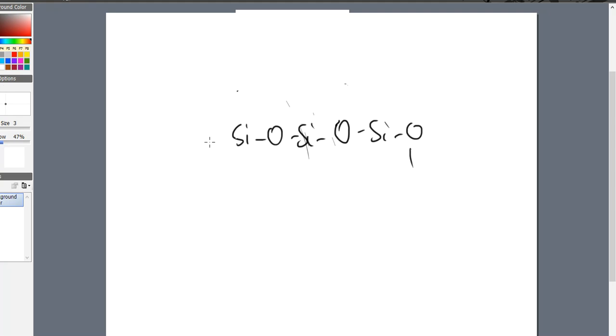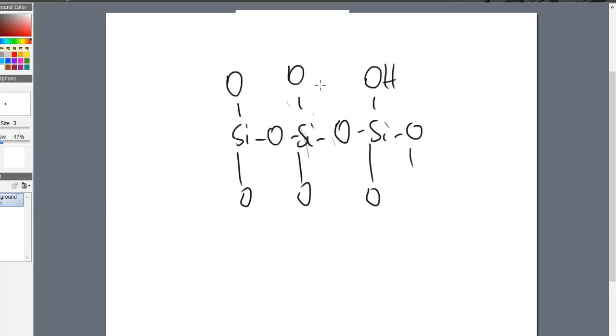Oh, no. Okay. So silica and silica and silica. I've got these other oxygens that are there, of course, and then on the silica I will see oxygens that are pointed on this end as well. And if that is the surface, these are the protonated oxygens that I have on the silica. So polarity is present in the stationary phase, polarity is there in the solvent. Absolutely, it's electronegativity driven, polarity driven, solubility driven. That's where the interactions are taking place unless they have been modified.